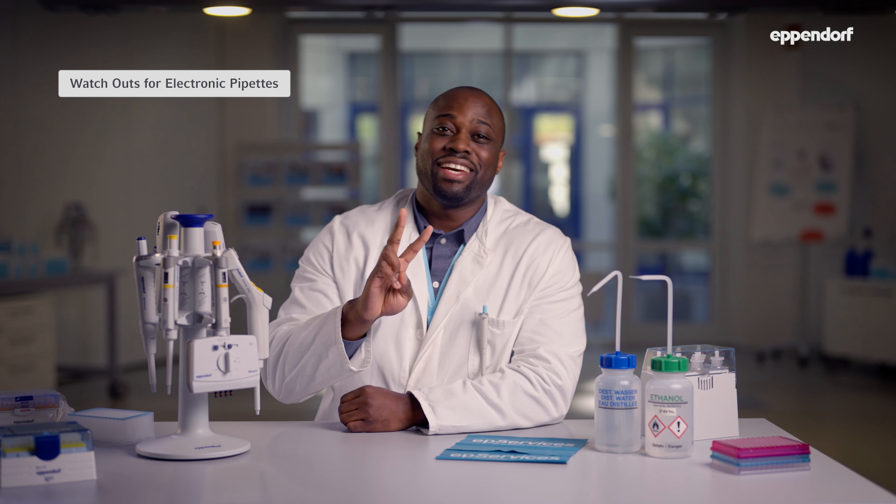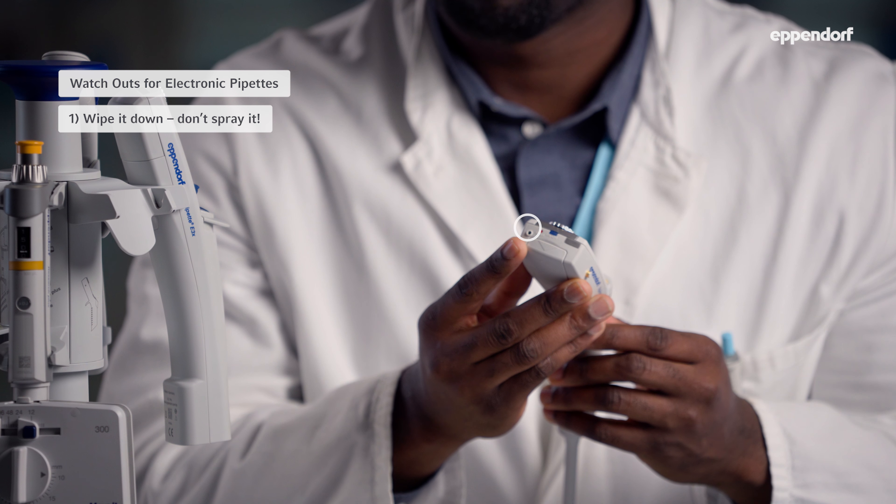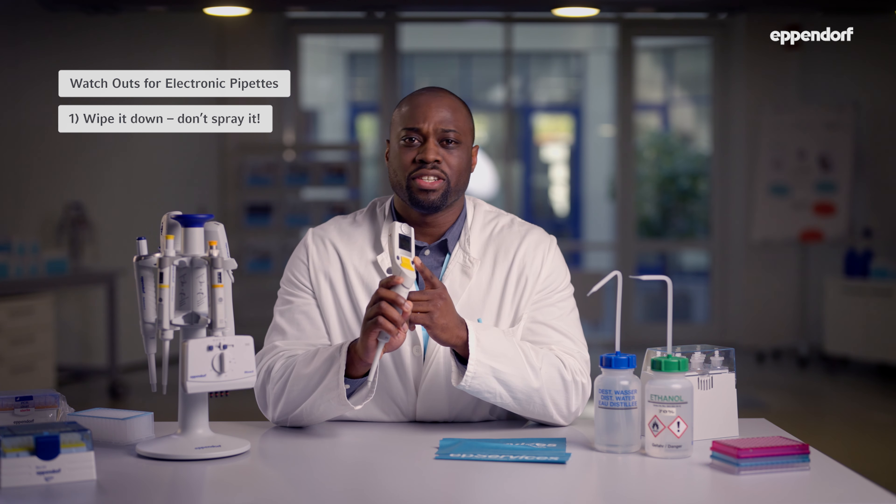We recommend cleaning the lower parts of your pipet at least once every quarter. When it comes to the maintenance of electronic pipets, we have two recommendations. First, don't spray any cleaning reagents directly onto it. Instead, wipe it. By wiping instead of spraying, you can prevent the reagent from getting inside the pipet through the charging port. This is also better for your screen if you are using aggressive reagents that can damage the screen over time.